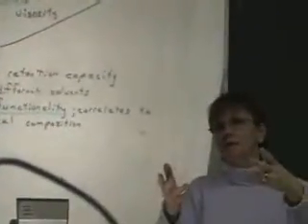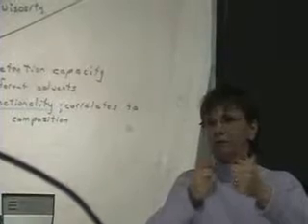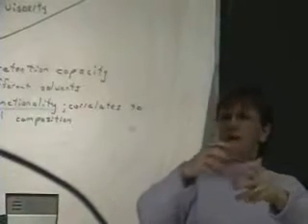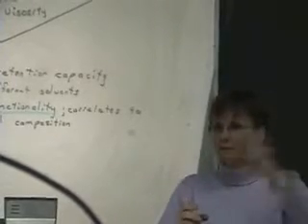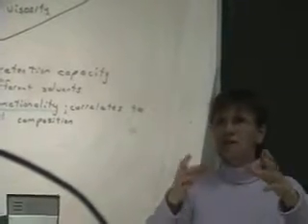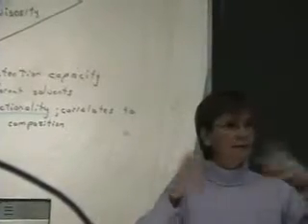What exactly is measured? You measure how much solvent is retained by the flour. So you take the flour, and let's say you're doing the 50% sucrose. So you have this liquid that's equal weights of water and sugar. You take a certain amount of that, add it to a certain amount of flour, shake it, let it sit there so that the flour hydrates, kind of like in your sedimentation flask.